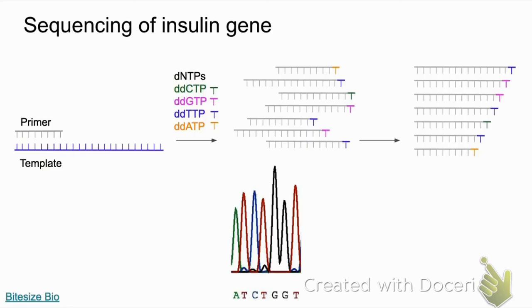Now, it's possible that during the cloning process, particularly the PCR amplification of cDNA, we may have generated mutations within the sequence of the gene we were trying to clone into the expression plasmid. And so we need to double check for that now. And we're going to use what's known as Sanger sequencing, or a modification of Sanger sequencing.